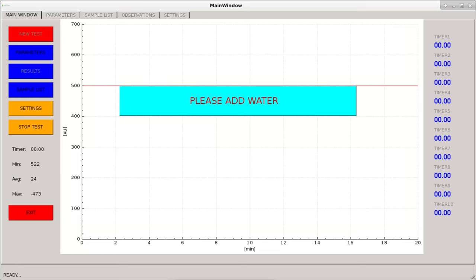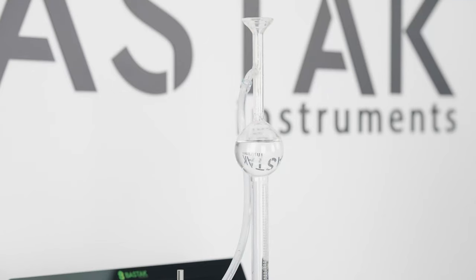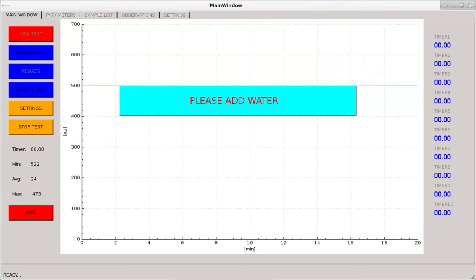At the end of the homogenization time, the warning 'please add water' is displayed. The 30-degree pure water previously transferred to the burette is poured over the flour sample in the kneading chamber. The add water warning disappears and the graph is created.